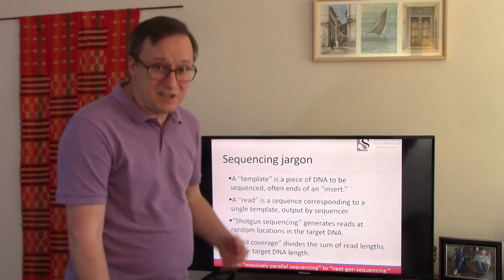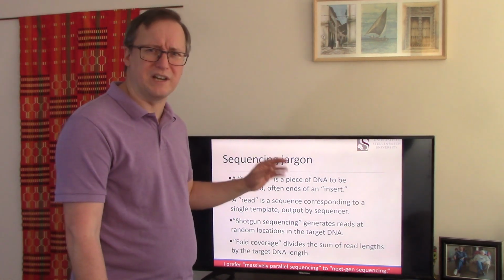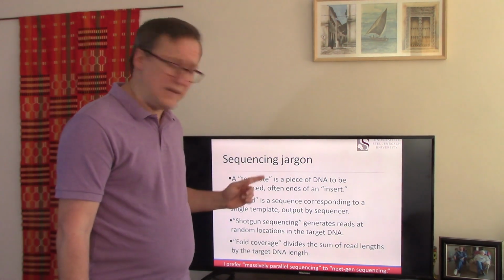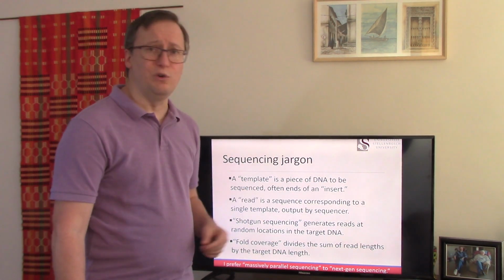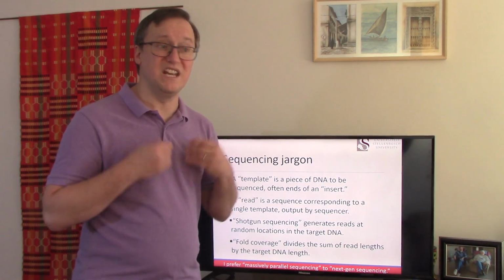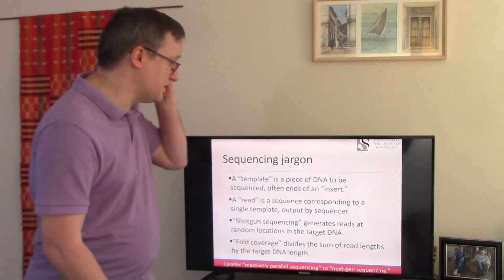Now, you can already tell that we're going to have a lot of jargon come flying our way in the course of this lecture, so I'm trying to keep some of that separated out so that we can keep track of these. So we start with a template. A template is the piece of DNA that we want to sequence. In the old days, at least, when we produced these template sequences, we were choosing them very carefully, often from an insert that had been stored in a library.